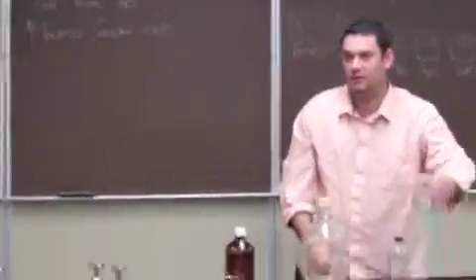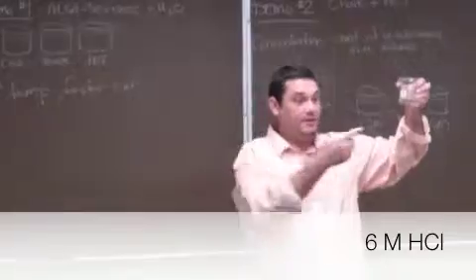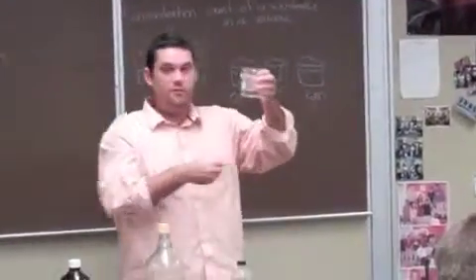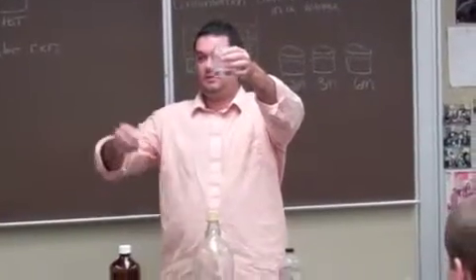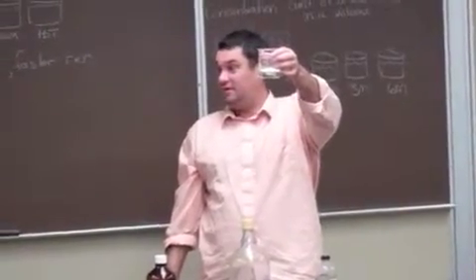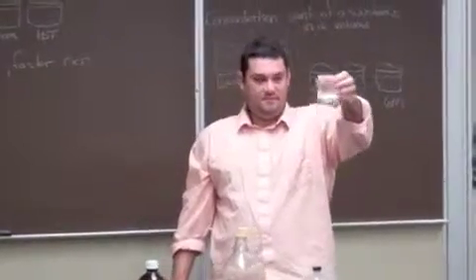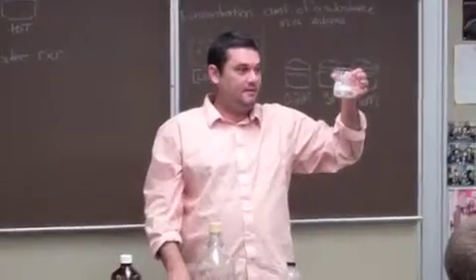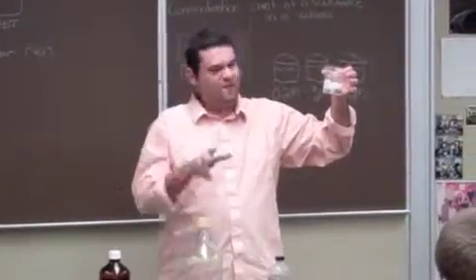6 molar. Prediction. We predict this would be the biggest. Do we actually make a prediction? I forgot. Ready? 6 molar. Dang, it's already floating. Kind of, there are other things going on.